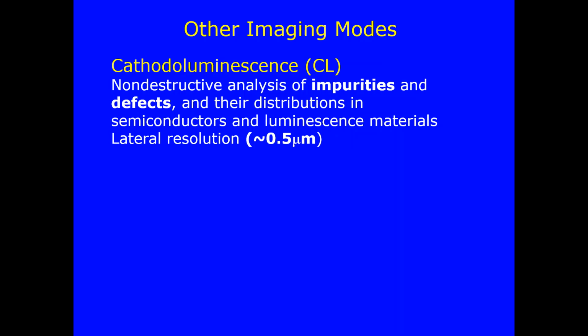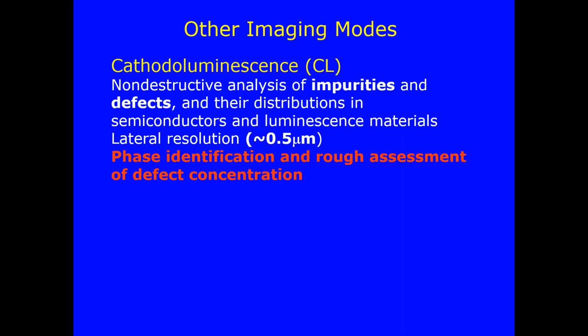It has a lateral resolution that is approximately equal to 0.5 micrometers. And with the help of these features, we can get phase identification and a rough assessment of defect concentrations.